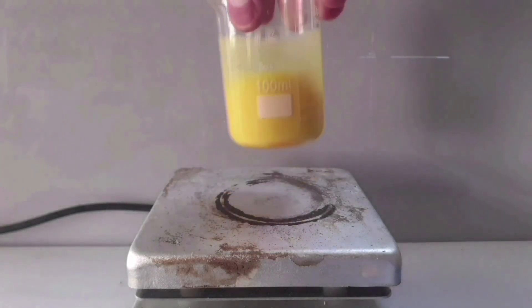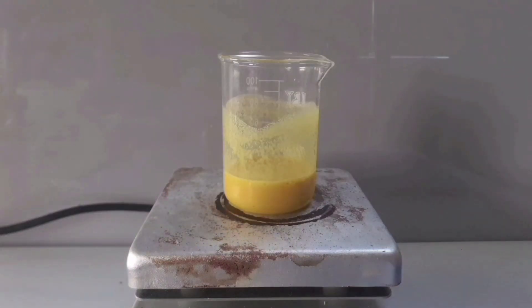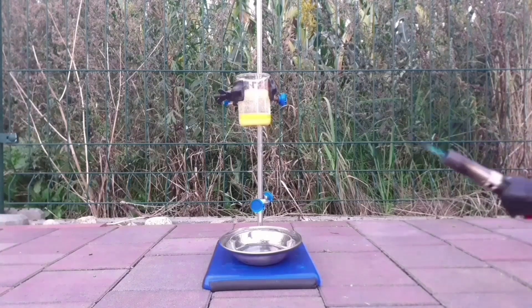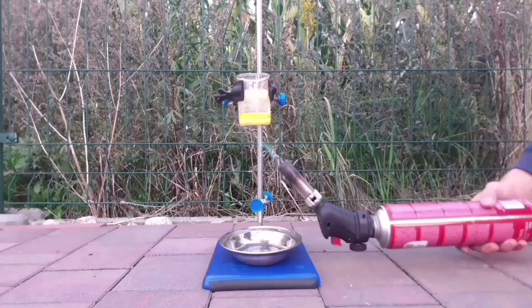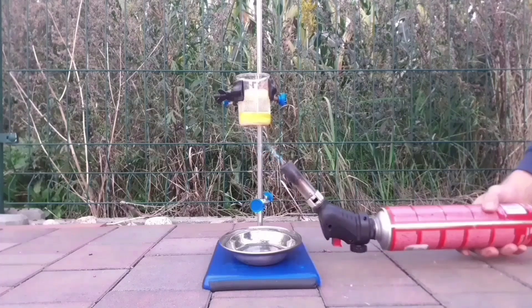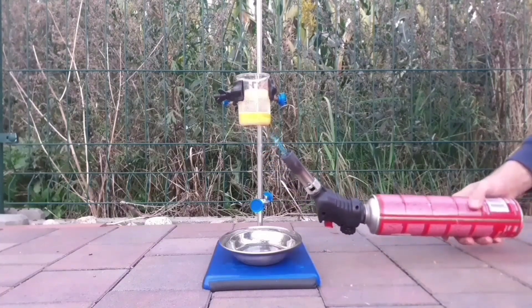In today's episode of cooking with a retarded moron, we will mix our hexachloroplatinic acid with some water and potassium nitrate. Then we will heat the hell out of it. The idea here is to oxidize chloride ions with nitrate ion. Anyway, this will grant us a wonderful mixture of toxic gases.